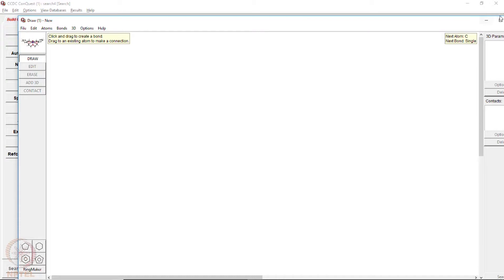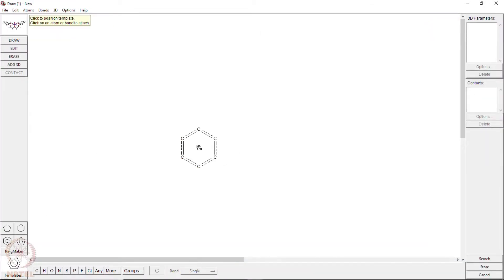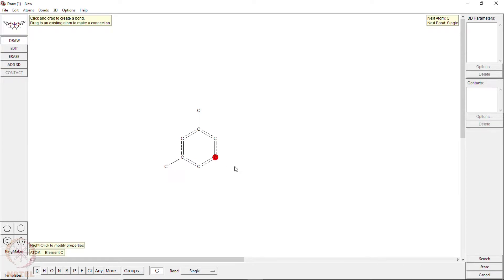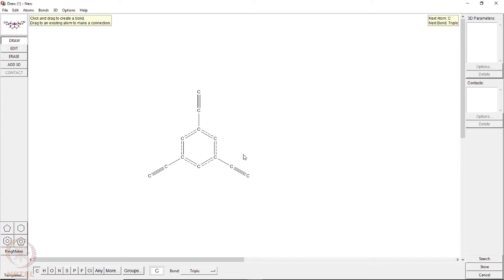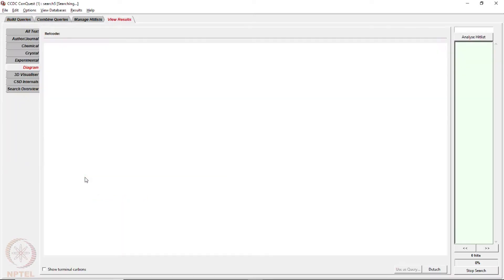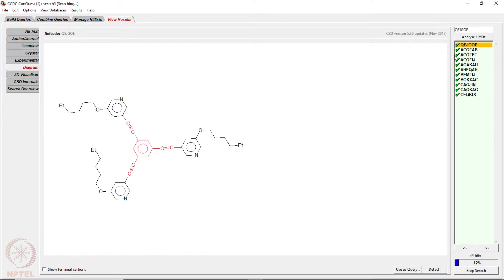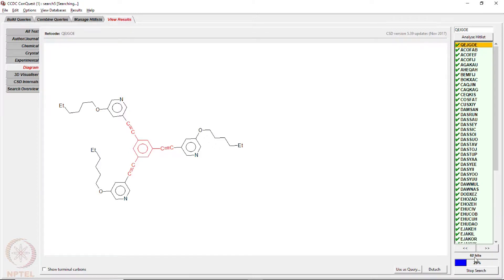Let us see another example. Suppose I put a molecule like this and want to see how many such molecules exist with a C≡C–C≡C–C arrangement — a 1,3,5-triacetylenic benzene type of molecule. How many such molecules are reported? Is there any organic molecule, any metal-organic framework based on that structure? You just hit search and it looks for all possible molecules. The list is still growing — it is only 37 percent — and the number of hits having that central red moiety keeps increasing.